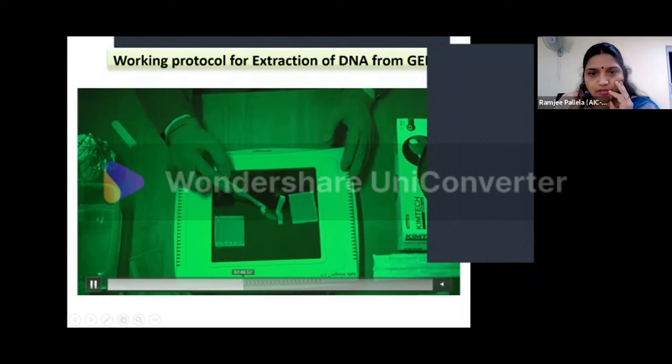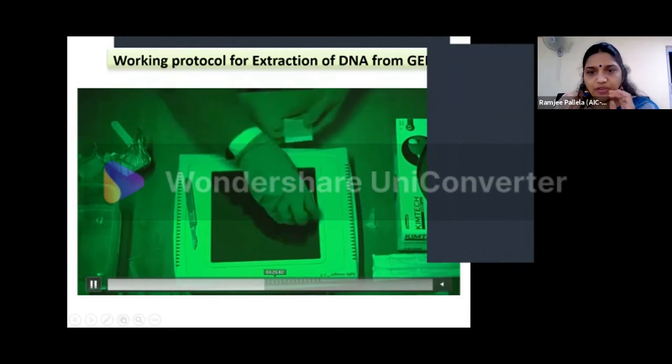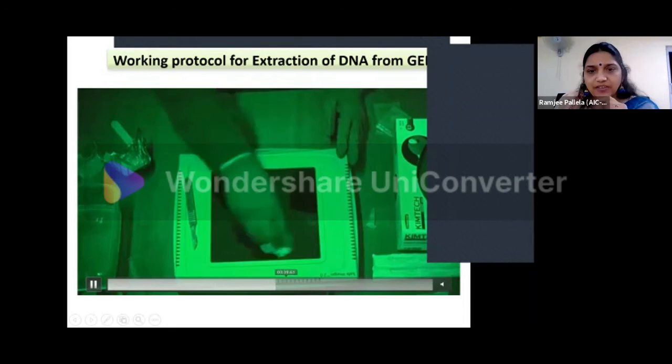And then you see here, these are the two bands. You can see fluorescent bands. These are the two things that we have actually cut from this particular gel. Now this we will be collecting, and the remaining thing we will be throwing away, and this we will be collecting and cleaning our transilluminator.